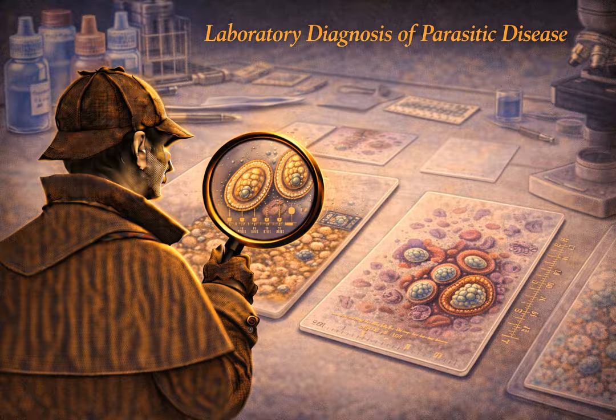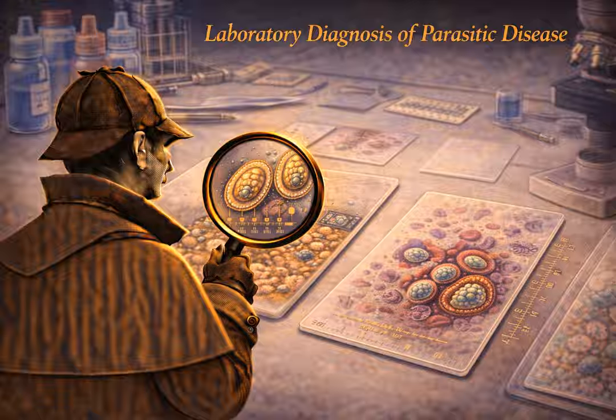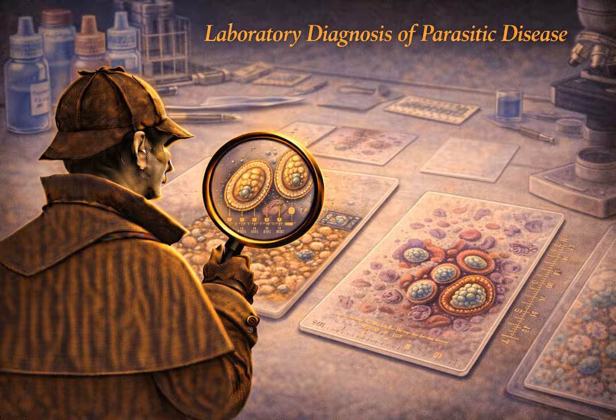We exploit specific gravity. The two main laboratory methods are formalin ethyl acetate sedimentation and zinc sulfate flotation. Flotation makes intuitive sense. You use a heavy liquid, and the lighter parasite eggs just float to the top. That's exactly the mechanism. Zinc sulfate is a very heavy, dense salt solution. The parasite eggs and cysts have a lower specific gravity, so they are lighter than the fluid. They literally float to the very top surface meniscus, and the tech just scoops them right off the top with a wire loop. And sedimentation is the opposite.